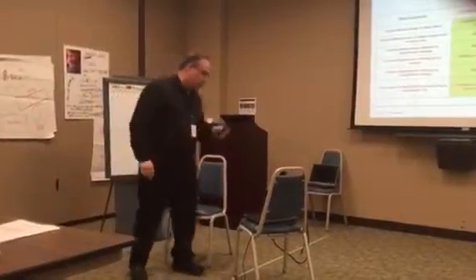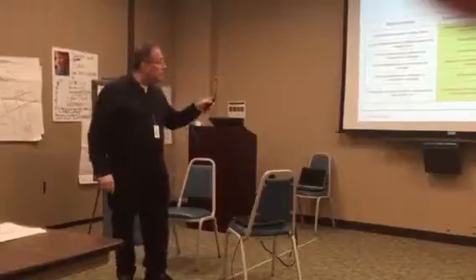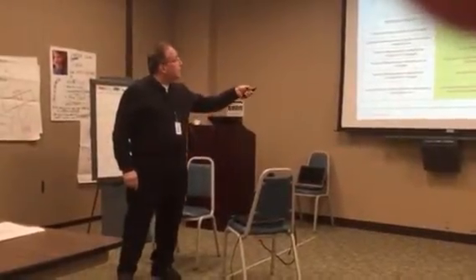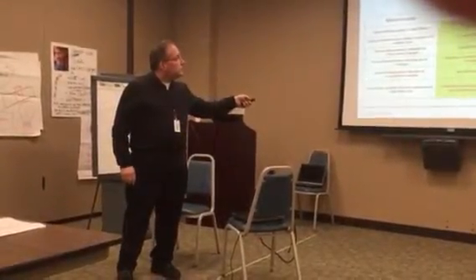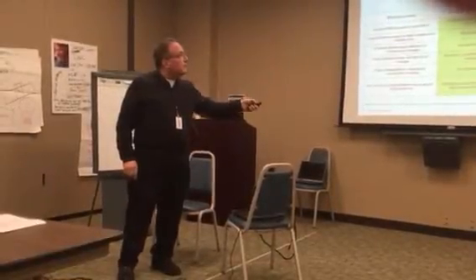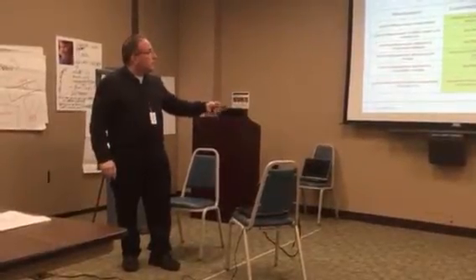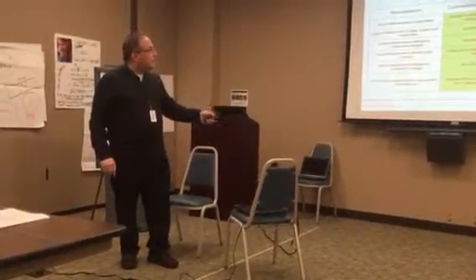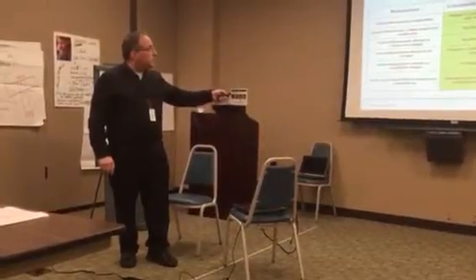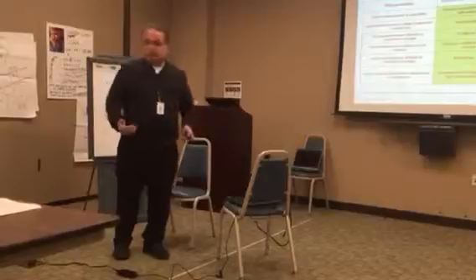So, chlorine can be measured by two techniques. An optical technique, called the colorimetric technique, which uses reagents, and an electrode technique that does not use reagents. What you see here in this table is in green some of the advantages of the particular measurement technique, and on the right, in red, disadvantages.